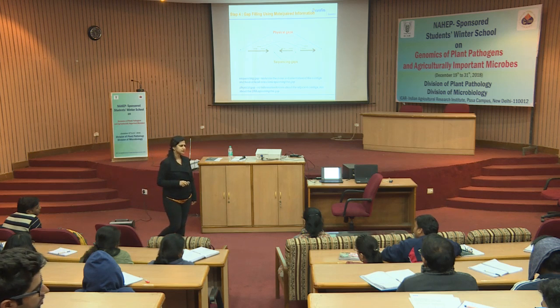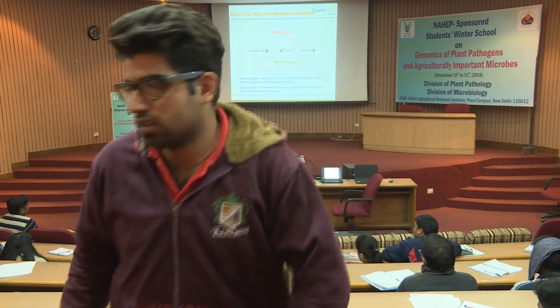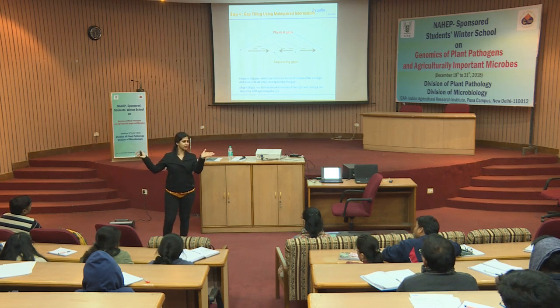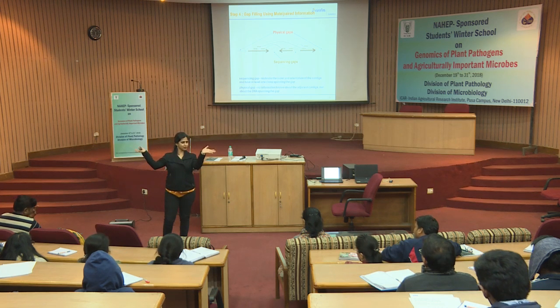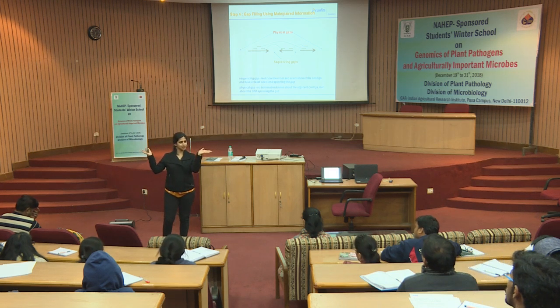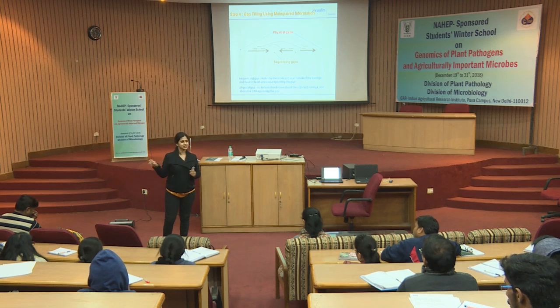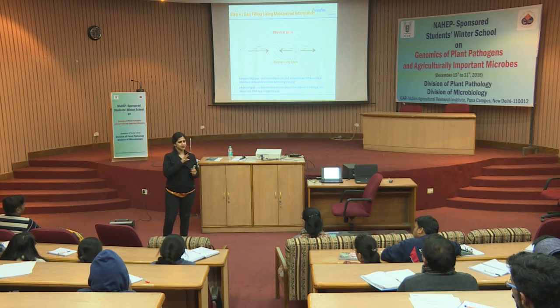Where are we getting that information from? In the sequencing we have an R1 and R2. In the library, I am creating a 1 KB library of MatePair. In my MatePair 1 KB, I just have a base of 150 and 150; the rest is all information that something is there in between. There is a distance between these two reads. So the assembler tries to assemble in that distance. We tell the software that this is a library with 1 KB plus or minus 200 bases, so it becomes 800 to 1200.